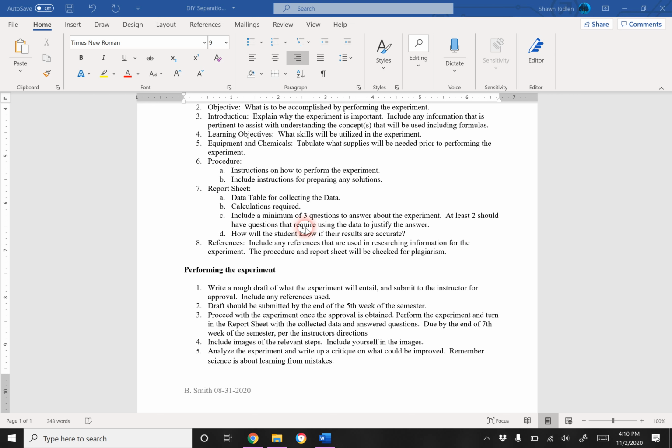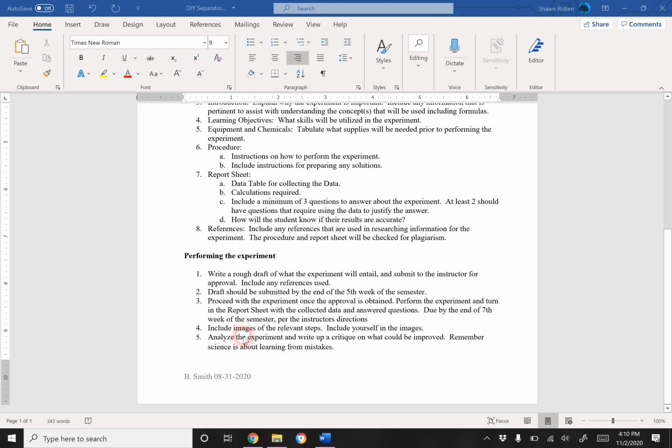Do you think it did not go well? And if it didn't go so well, what didn't go well? And if it did go really well, what steps do you think were important to making it go well? So this 5th step, I would basically, I think, just write a conclusion section in my report. That's what I would do. Or if you want to, you could also include that as a separate document. That's totally okay too.